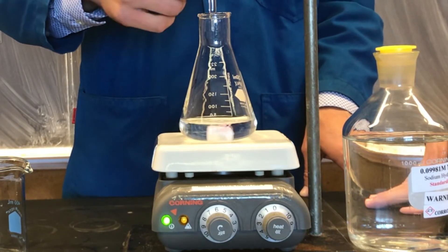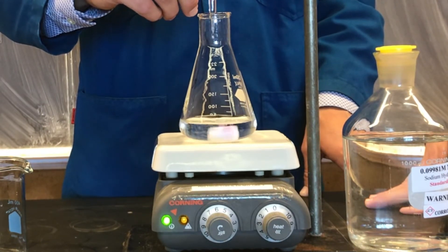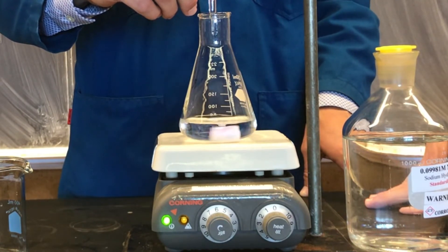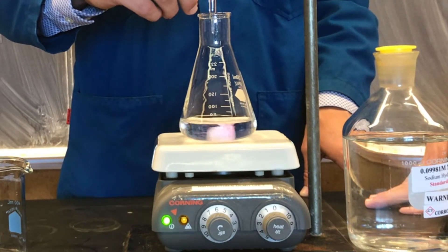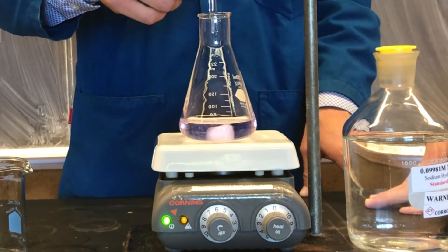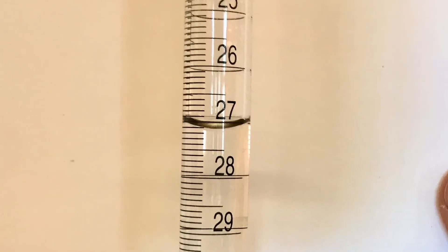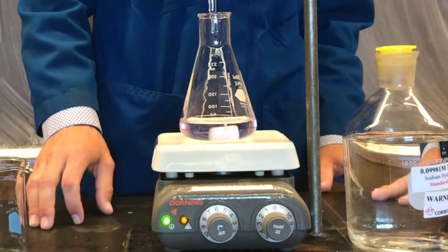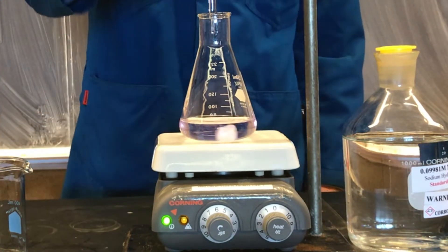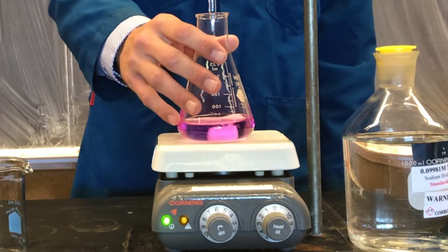When we see a faint pink color appear where the titrant meets the dilute hydrochloric acid solution, we should slow down how much we're adding. We should approach our endpoint dropwise. When a faint pink color persists throughout the diluted hydrochloric acid solution, we've reached our endpoint. It is essential to record the final burette reading after a titration. You can see that a small amount of sodium hydroxide added to the reaction flask will turn our faint pink color to very bright — this is past the endpoint.